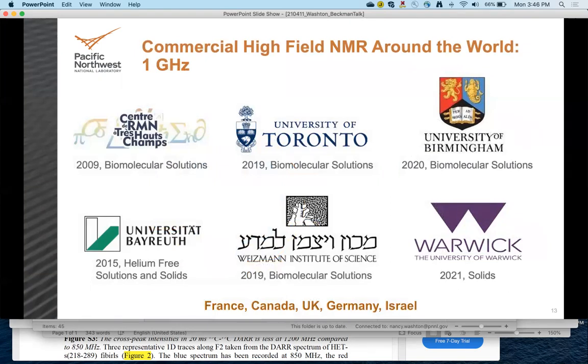So commercial high field NMR, although I say around the world, is almost entirely within the United States and Europe. I was unable to obtain data on high field instrumentation throughout Asia. And so this talk will focus primarily on Europe and the US. So what you should notice right off the bat is that of the systems here that were 1 gigahertz, there were none in the United States, and the majority of them were focused on biomolecular science areas.